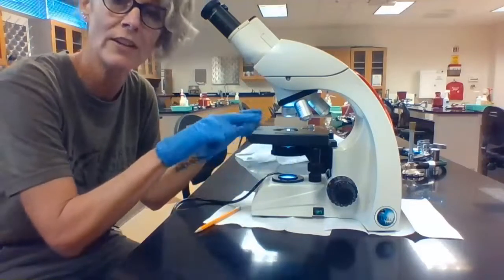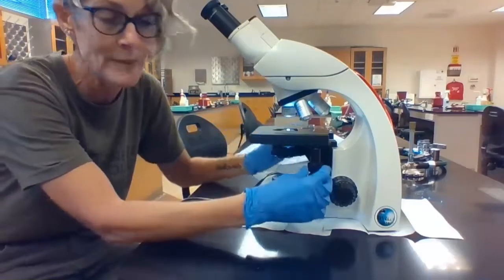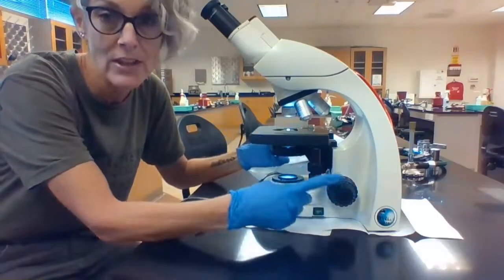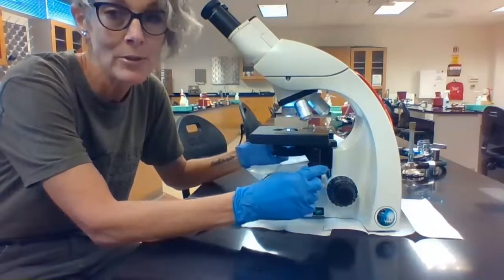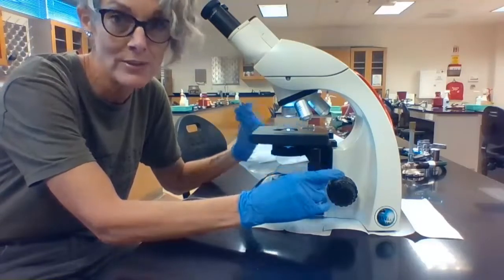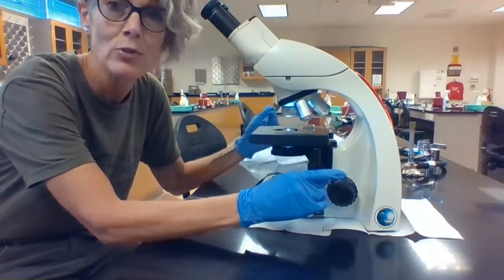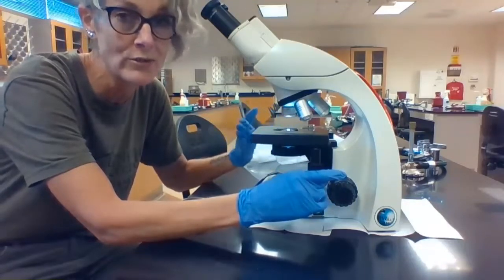Your specimen is going to sit on this, which is called the stage. The stage is controlled by the mechanical stage apparatus. There are two knobs, an upper knob and a lower knob. The upper knob will move your specimen back and forth, and the lower knob is going to move it side to side. This way you can move your field of view across the slide as you're viewing it.